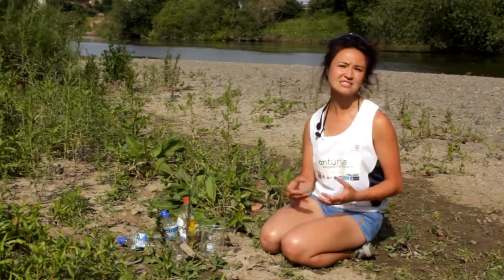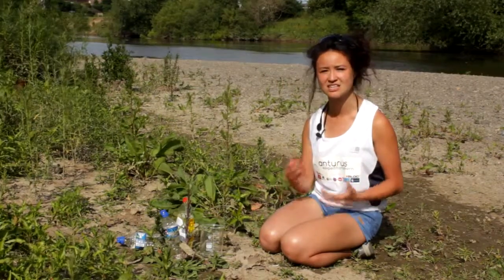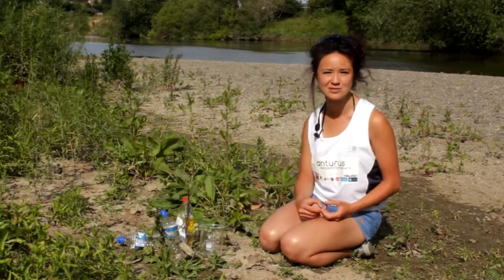And one way is to test your water for its hardness, and that's what we're going to be doing today in this resource. So what is hard water and what is water hardness? Well, it's not a measurement of how sore it will be if I fall off my paddleboard and into the River Severn. Rather, it's a measurement of how many ions are dissolved in the river. That is, more specifically, calcium and magnesium ions.